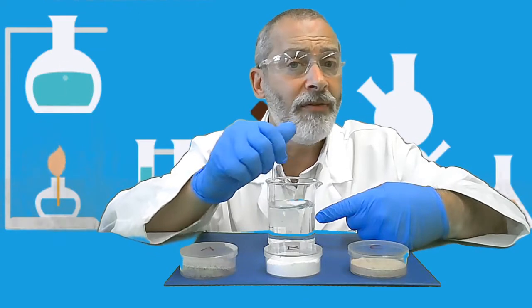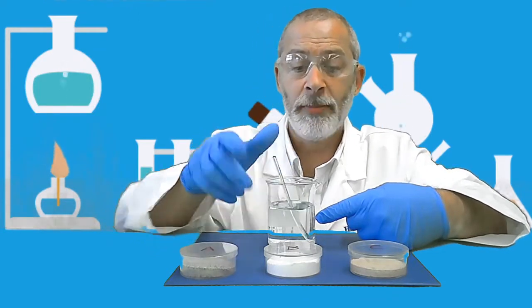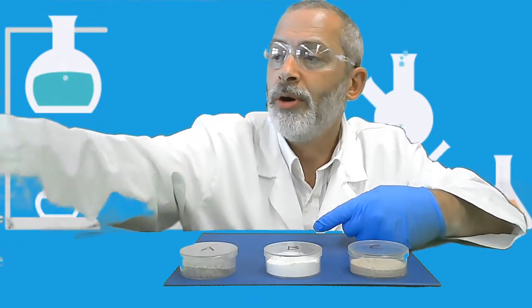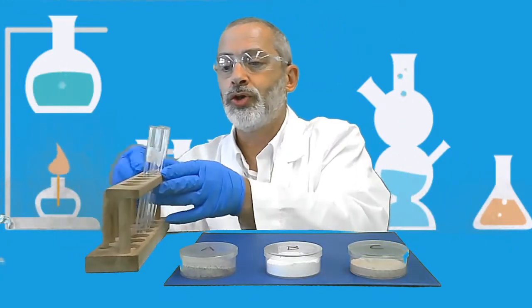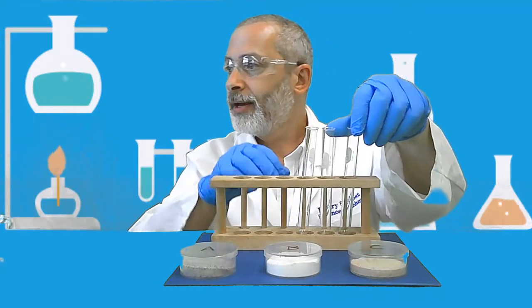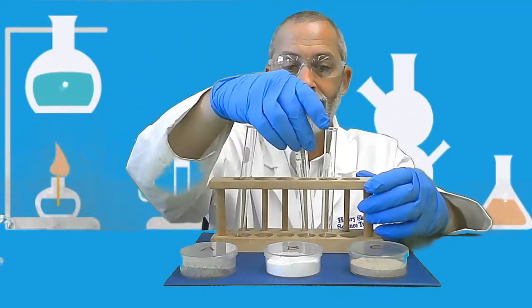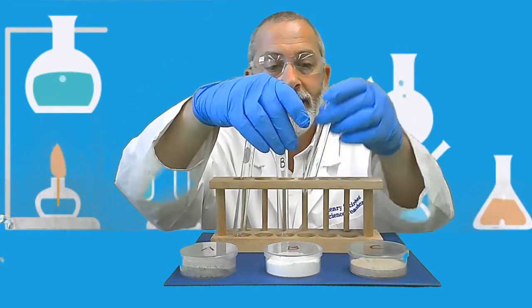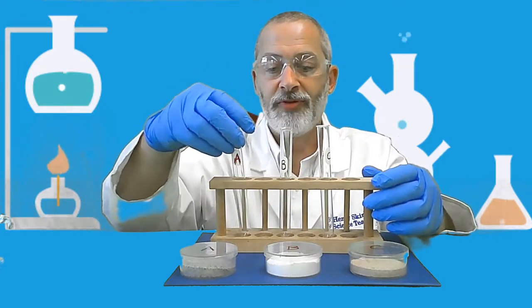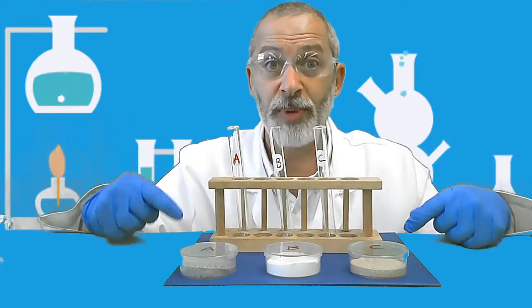But there are a couple of other things that we need to provide some basic needs. So I'm going to put this beaker off to the side for a moment, and I am going to bring over a test tube rack. A test tube rack with 3 test tubes labeled A, B, and C. I am providing here in these test tubes a living space.